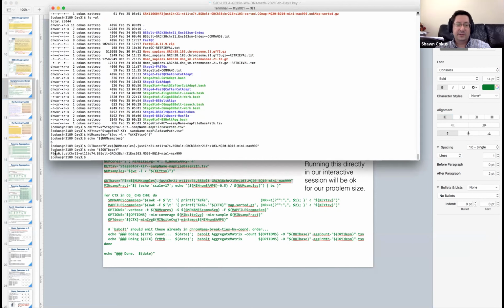And rather, there's a point where you can't really pack all the data in the file names, right? So rather than actually list the sample names in this thing, I just called it plex 6. It's a multiplex of 6 things together. And there's a point where you can't let the file names grow this big. Your operating system has a limit at some point. On Unix, Mac, it's usually around 250. On Windows, I think it's more like 250 inside the OS, but the GUI doesn't like stuff beyond like 30.